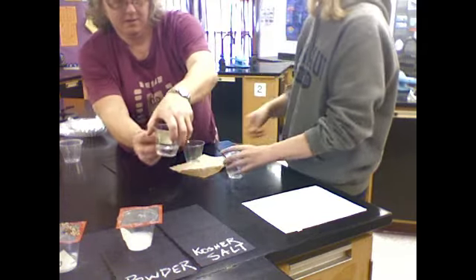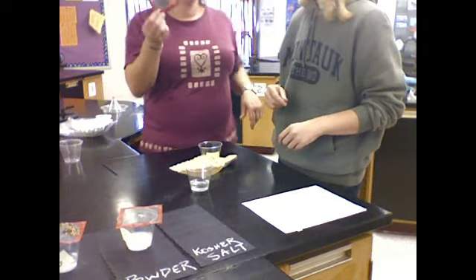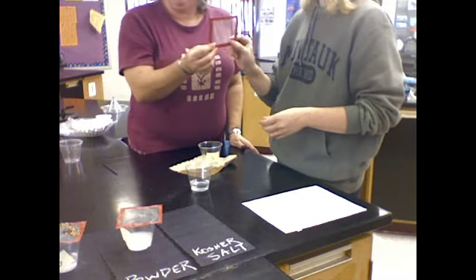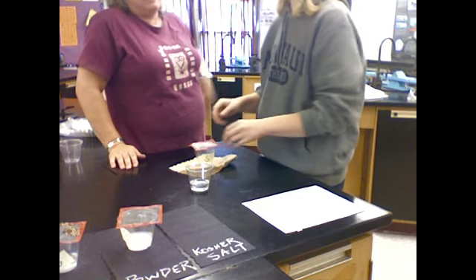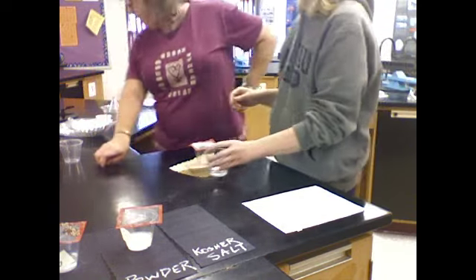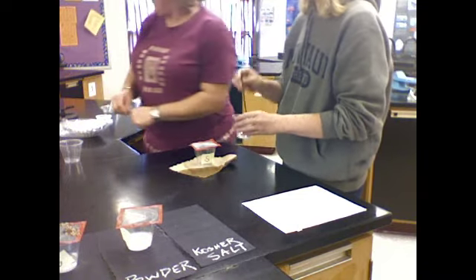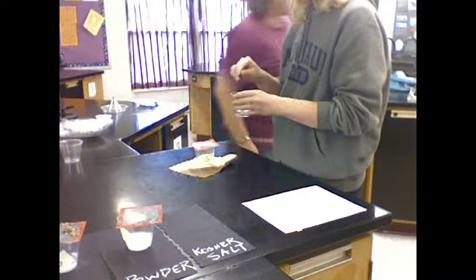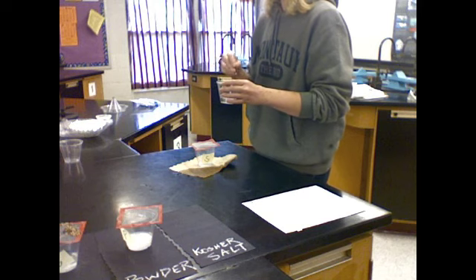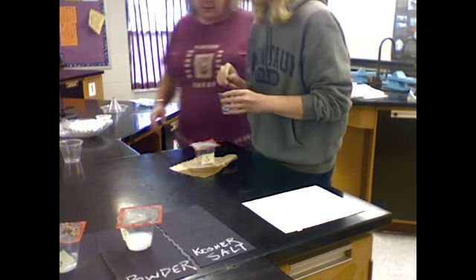Okay, let's label that. I have a different clean screen. Always important. If I was in my lab group, we'd be using one screen, but we'd be rinsing it in between. You got it. Okay, so you need a clean stirrer. It said to stir the mixture thoroughly, so I'm going to stir it thoroughly. Now I can't see the particles of salt in here anymore, but I wonder if the screen will catch it. I'd be interested to find out.